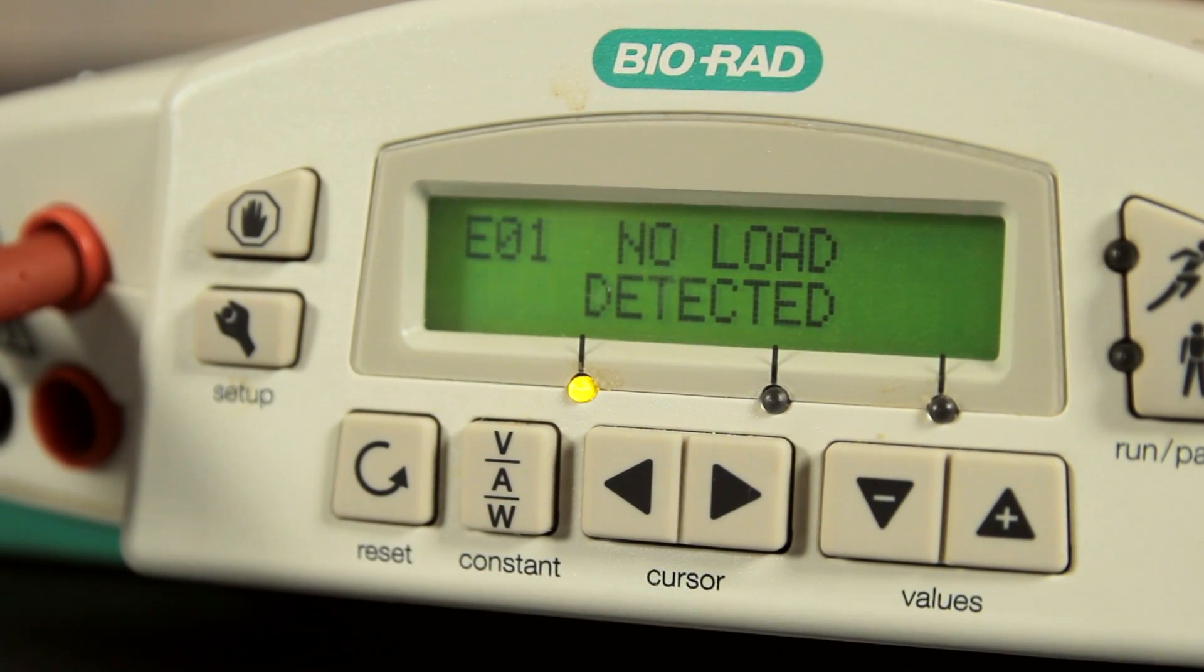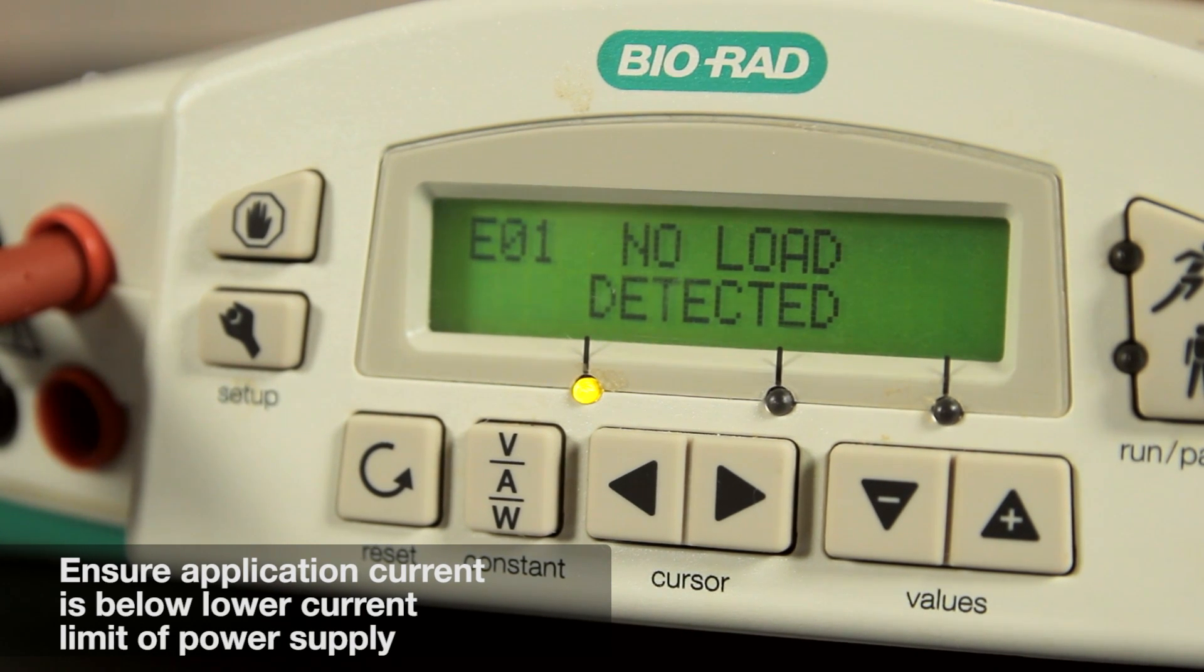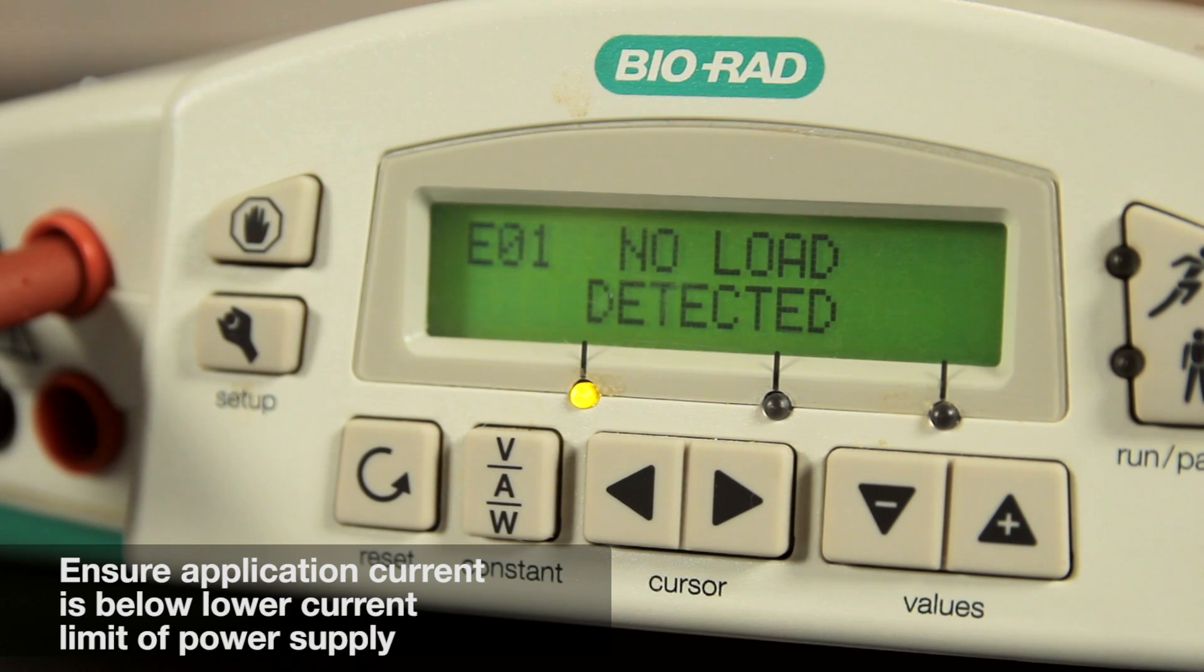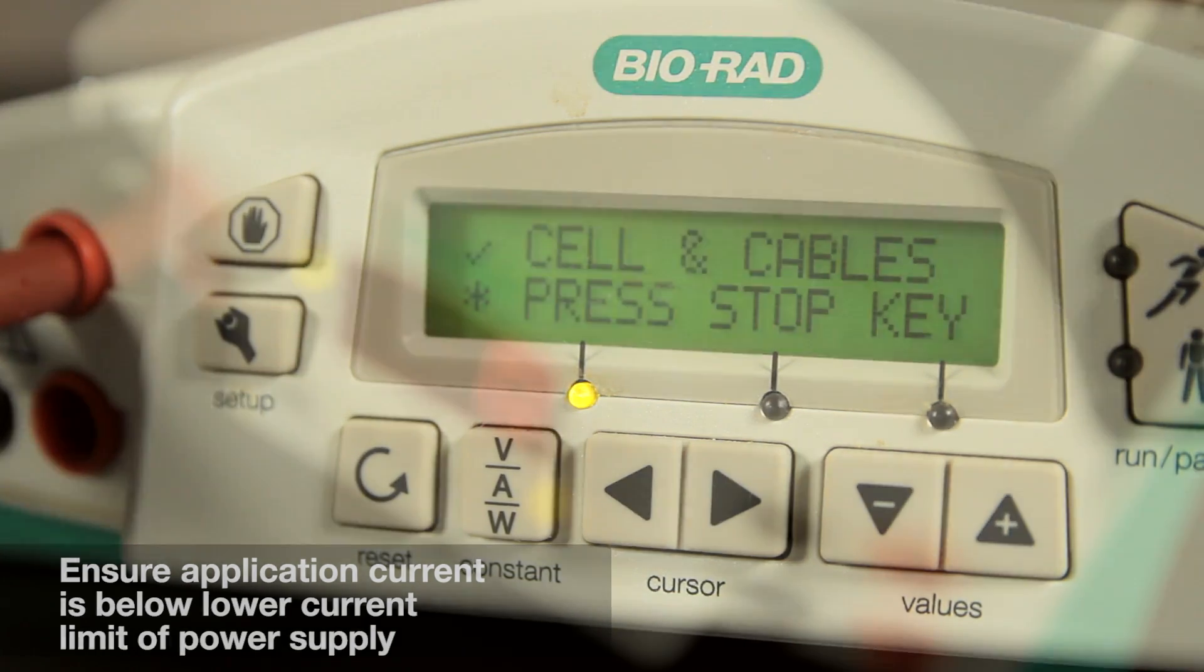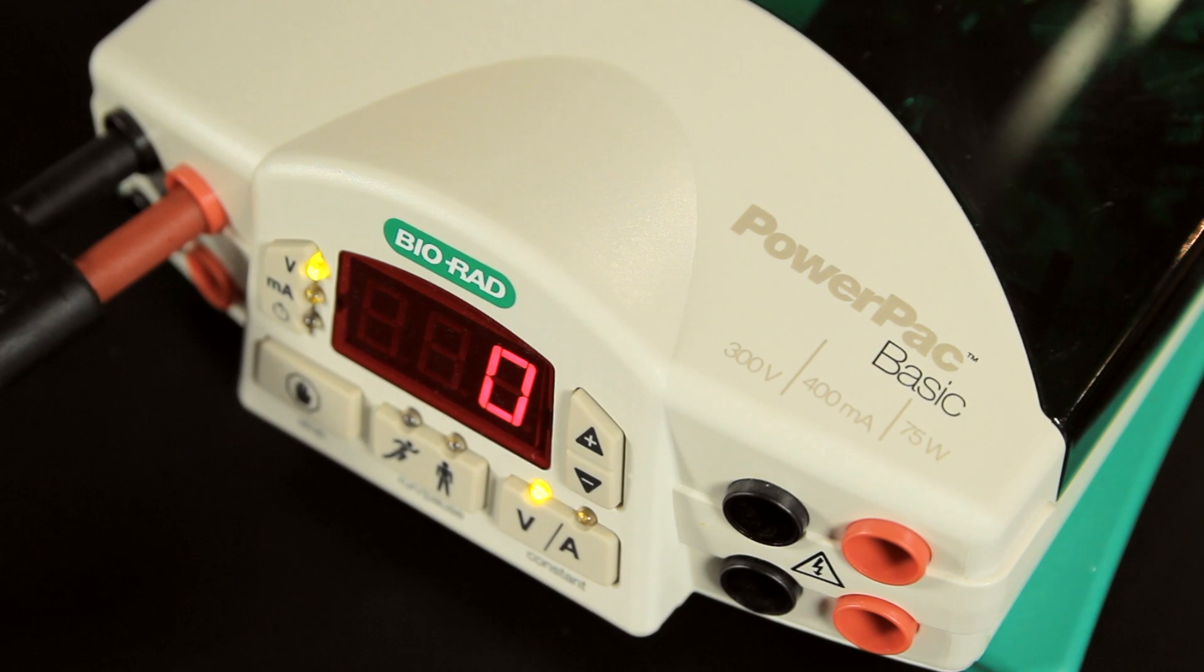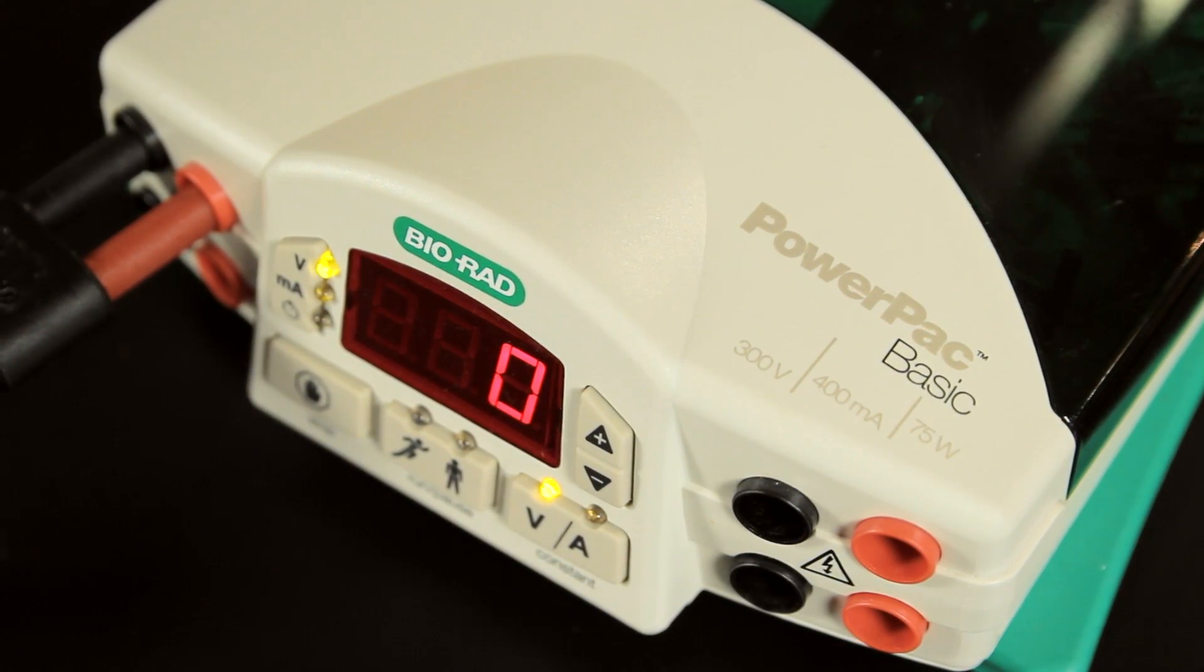An E1 error can also occur when the application current is below the lower current limit of the power supply. Some applications, for example an IEF ready gel, typically have very low current during the run. In this case, you want to use a power pack with a lower current limit, such as the power pack basic, or turn off the no load detection, if necessary.